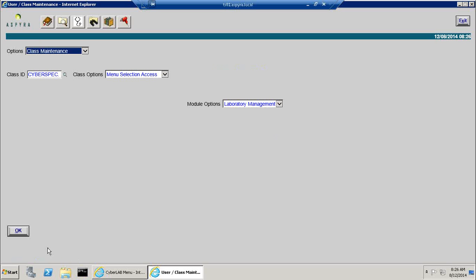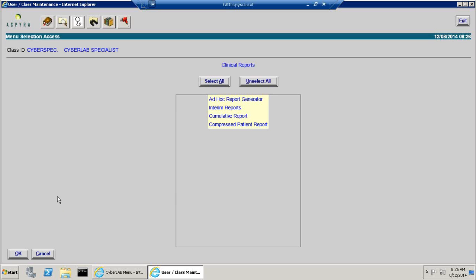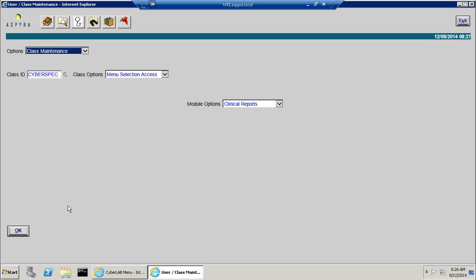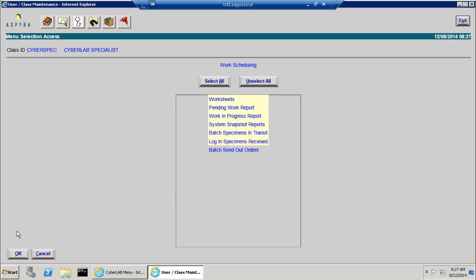So there aren't a whole lot of pages because it's basically a redundant double check of all of the menu items that are in each of the different segments and whether or not that class of user should have access to those. So one of the things that it would be a recommendation for Mr. Kwa or for all is to go through the user classes and see if they're all there.